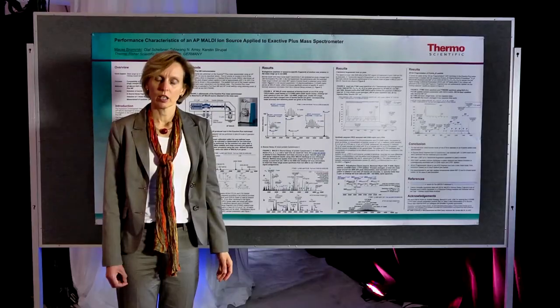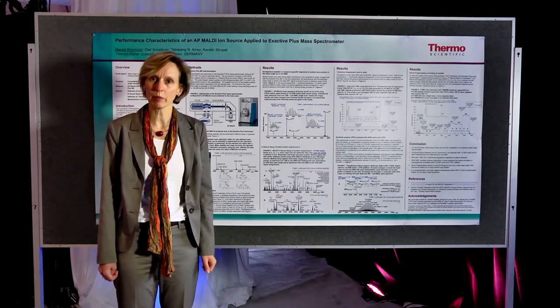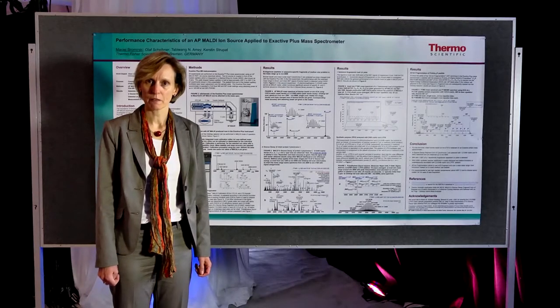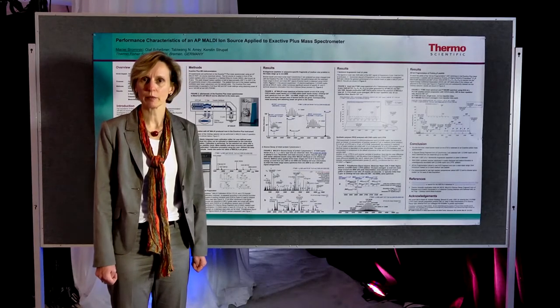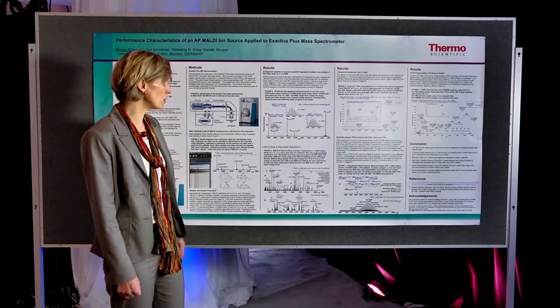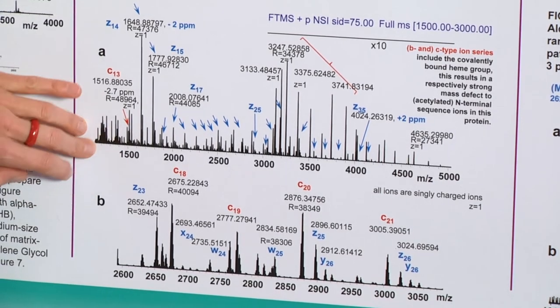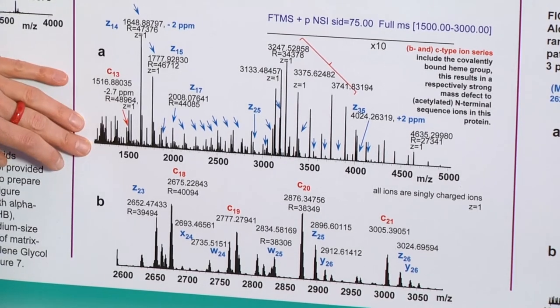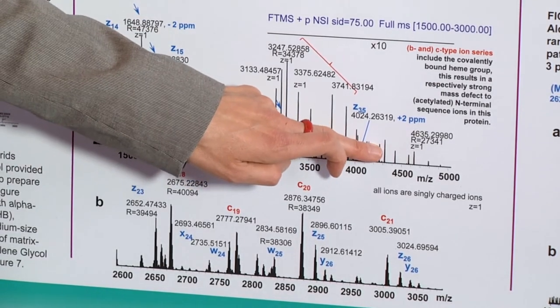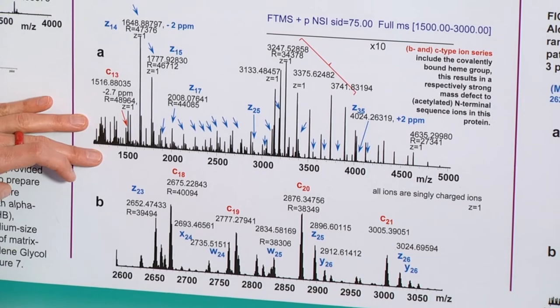Another application example is the application to intact proteins prepared with 1,5-diaminonaphthalene matrix, abbreviated 1,5-DAN. As a gift of nature, this matrix provides sequence-specific, intrinsically occurring fragment ion types of both the C-terminal and the N-terminal site of the peptide or the protein. In this example, cytochrome C is intactly prepared onto the sample plate with this matrix, and it falls apart upon the MALDI desorption process into complete sequences for Z-type ions. No sequence amino acid is missing here. And the same is true for fragments deriving from the N-terminal site.